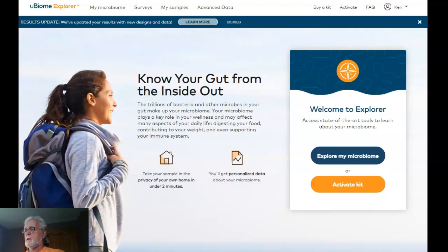Okay, I'm going to attempt, keyword attempt, to show you how to take the FastQ data from uBiome and process it with an independent provider and get results. I'm hoping to remember all the steps I did before, so there may be a few hiccups as we go along.